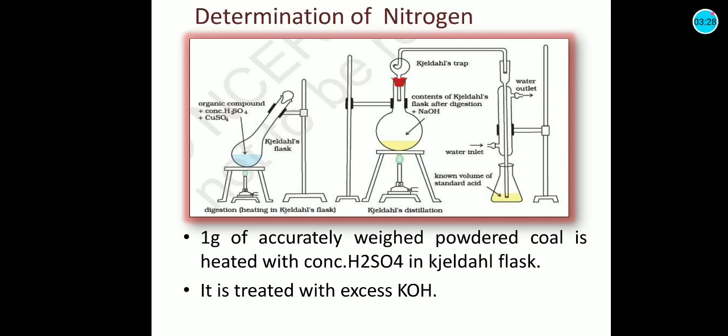Then determination of nitrogen. This is the equipment, the Kjeldahl flask. This is the glassware of the Kjeldahl flask.